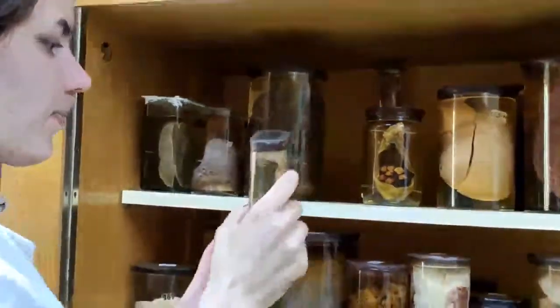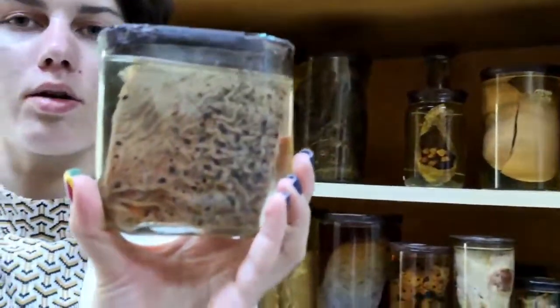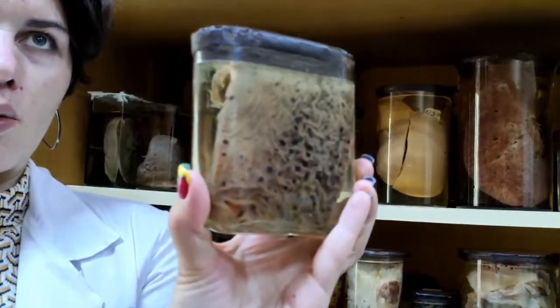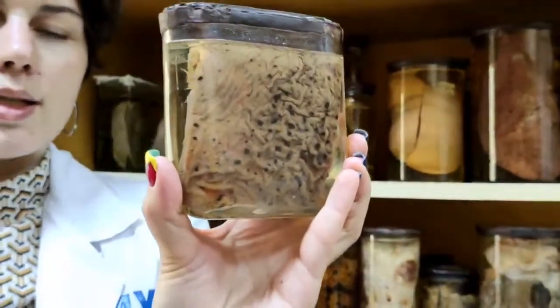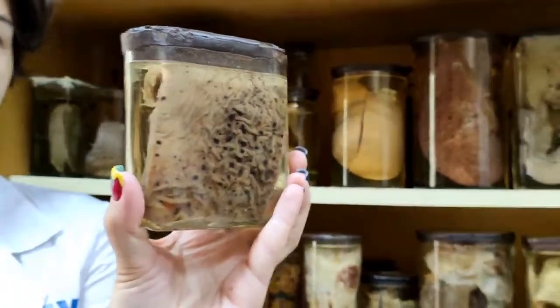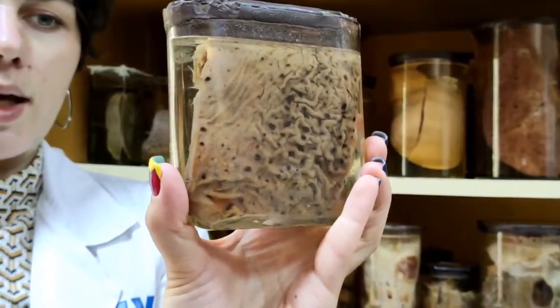The next one is stomach. Stomach with erosions. You can see the mucosa. The mucosa is quite normal; I mean, we can't see any exophytic or endophytic lesions here, but you can see these spots of black color. These spots are erosions. Why do we see this black color?